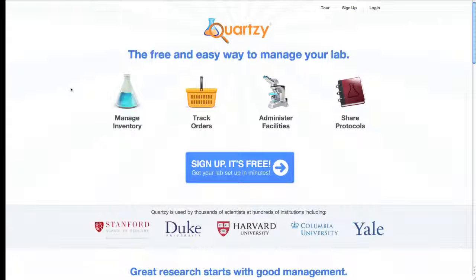So there you have it. That's how to get signed in and set up on Quartzy in 5 minutes. If you have any questions, make sure to email me at adam@quartzy.com.